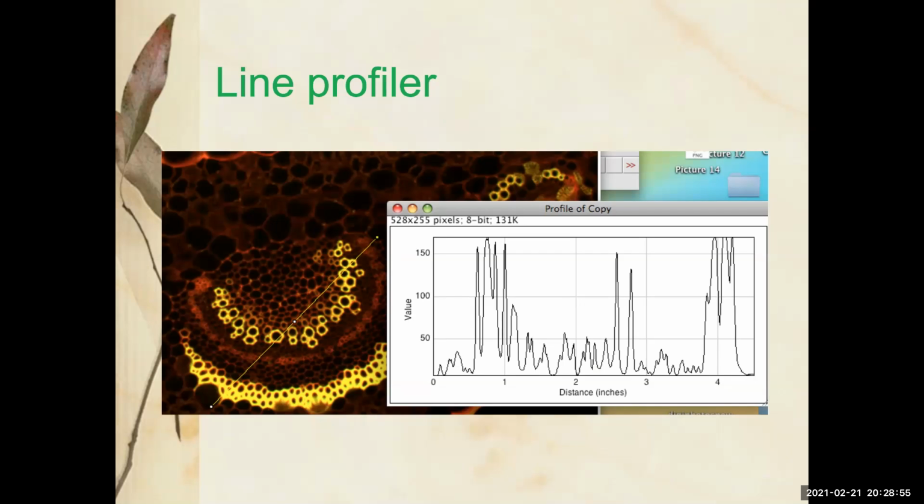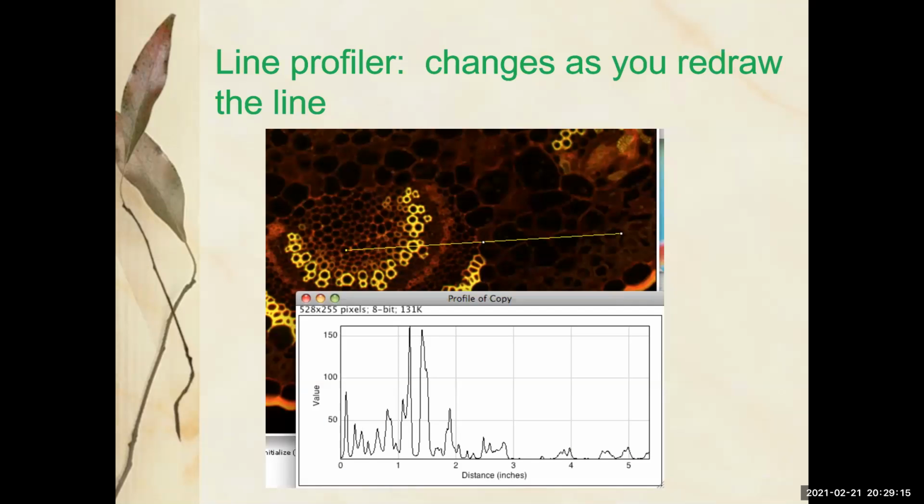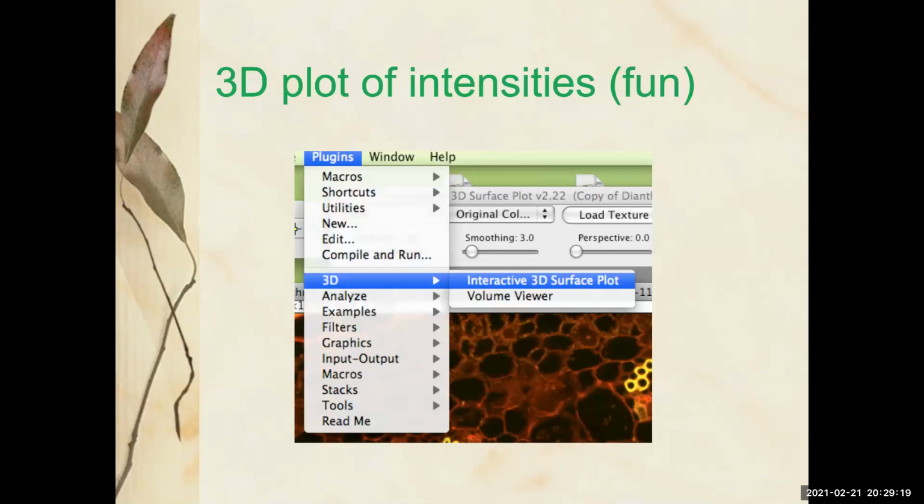And you can have a histogram of just the line. You can look at this and see where, at the beginning of the line, there's a brightness. That's that first yellow ring, saturated, by the way. Then it gets dim, and then it gets bright again. If you're doing real analysis of actual data, this gets very exciting, that you can be like, let me count this part of the image. Let me see what's going on with this part.